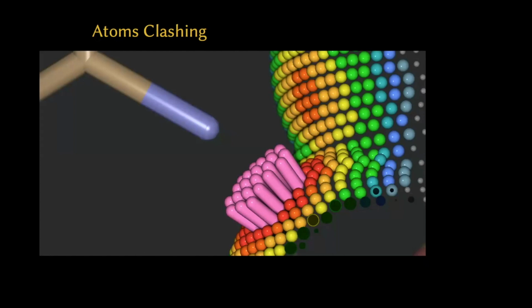And here I'm representing, as you can see, various degrees of discomfort with these pink sticks or tubes or pills. They're representing a clash, whereas before we represented a clash with a pink stick. Here we have a pink tube. And that looks rather appealing, and it's also interactive. As I'm moving the atoms around, the atom clash gets updated because, as I said, it's now calculated with threads.